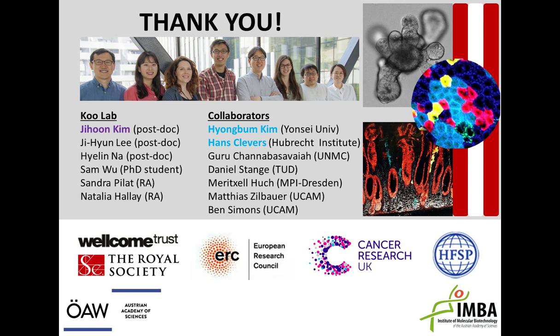Yeah, so the matrix that we are usually using is called Matrigel, but there are several comparable matrix materials that you can use, such as BME or Cultrex. So these are also working pretty well. There are currently a number of papers out there which show similar activity with a different substance, but these are still preliminary, I would say. It has to be extensively tested by many labs to be used instead of the Matrigel-based system.